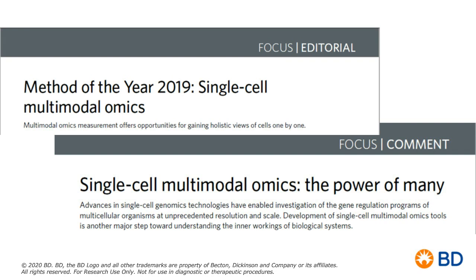With the Rhapsody assay, the cartridge can easily accommodate cells of about 25 microns. After about 25 to 30 microns, you will start to see a small degree of drop-off of capture efficiency. But typically, for the maximum degree of capture efficiency, I recommend staying below 30 microns, preferentially below 25 microns.